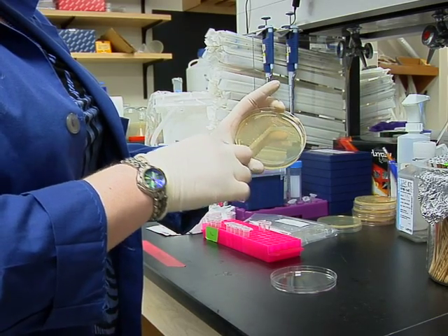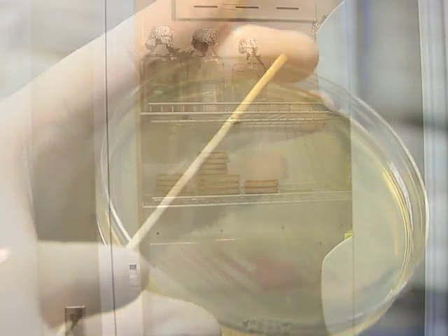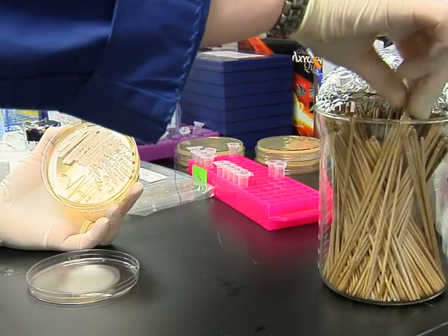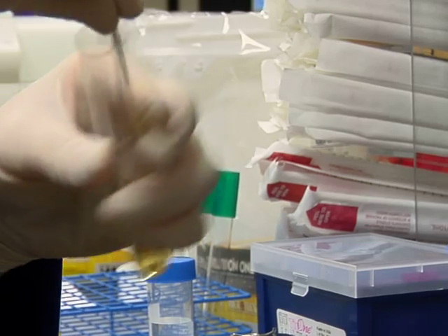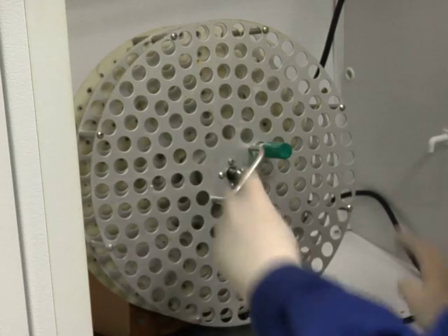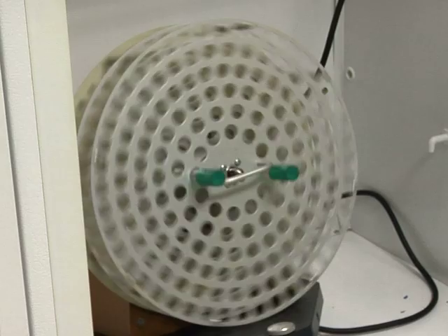Begin by streaking a Candida albicans stock on a yeast peptone dextrose agar plate. Incubate the plate overnight at 37 degrees Celsius to allow colonies to grow. Once the colonies are visible, use a sterile wooden dowel to pick an isolated colony and dissolve the yeast in 5 ml of fresh yeast extract peptone dextrose broth in 16 by 150 mm culture tubes. Place the culture on a tissue culture roller drum equipped with a test tube wheel and incubate it overnight at 37 degrees Celsius.